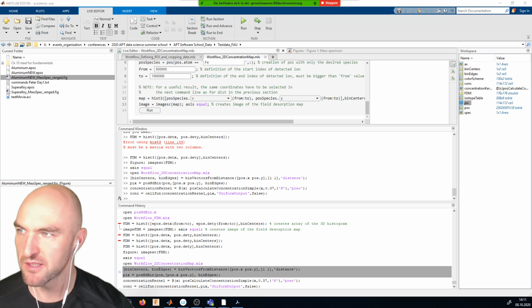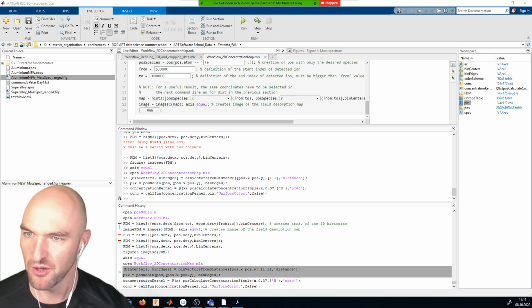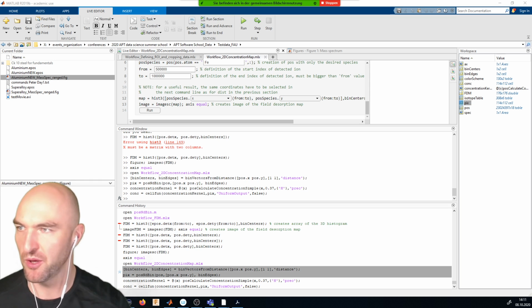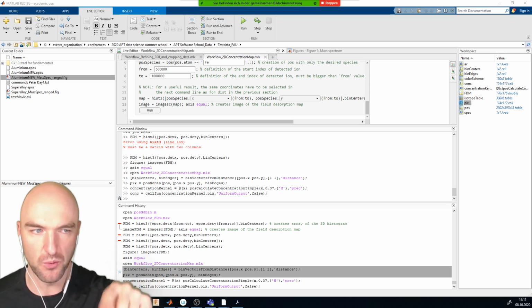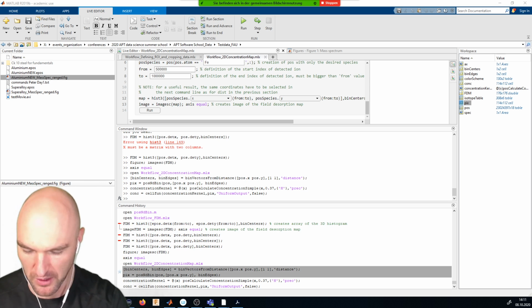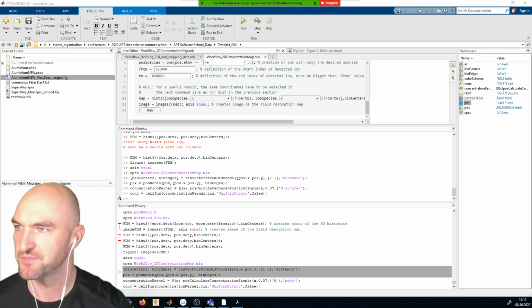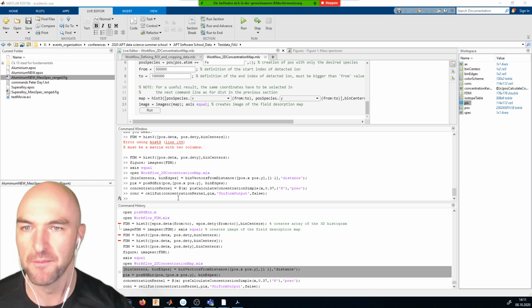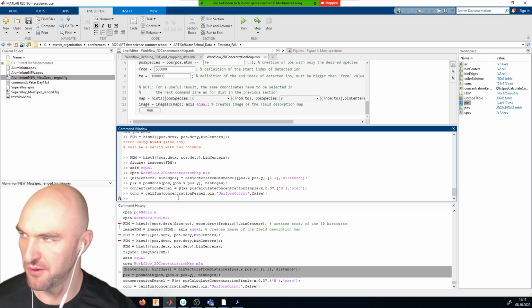If the dot is on the edge of the bins, then you make a decision on whether you want to have all of the ones. Essentially, you want to have a less-or-equal or a larger-or-equal sign to put it into the bins, but they won't get lost. But this is something we haven't accounted for in this version.